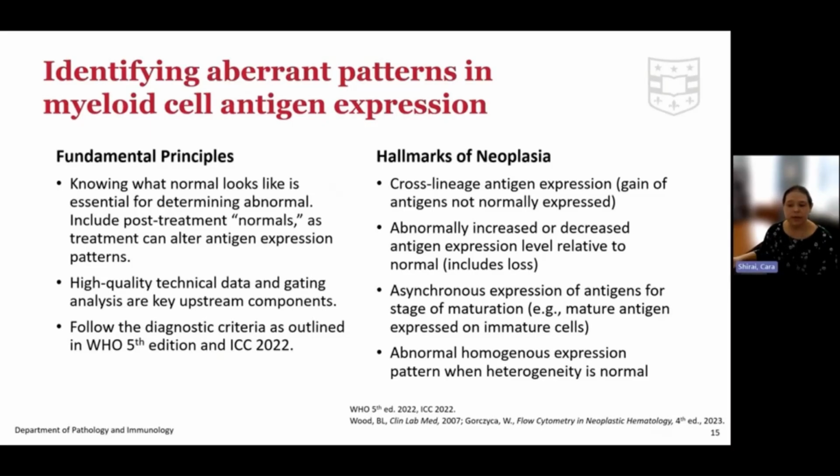Another is asynchronous expression of antigens for stage of maturation. For example, mature and immature antigens are co-expressed. Finally, abnormal homogeneous expression patterns whenever heterogeneity is the normal.